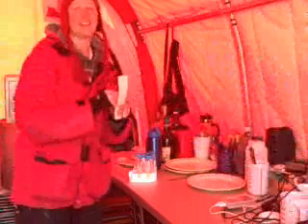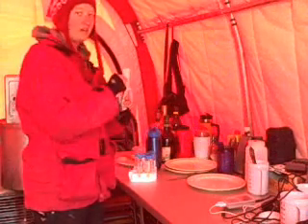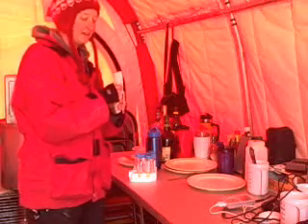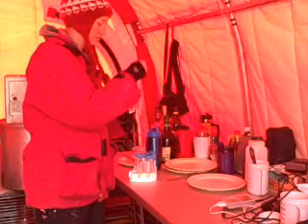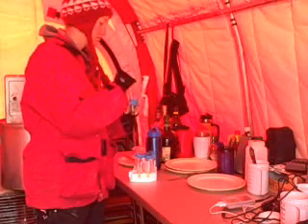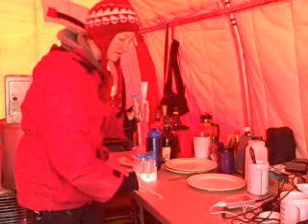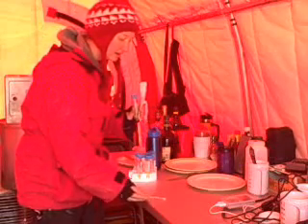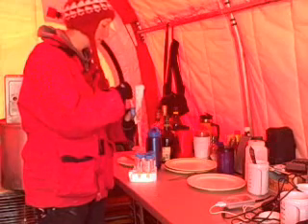We're in our kitchen tent where we make and eat all of our food. So we're going to test and see how many microorganisms we might find on our table. So we'll just swab it all over our table, see what we can get. Swirl it in our media.